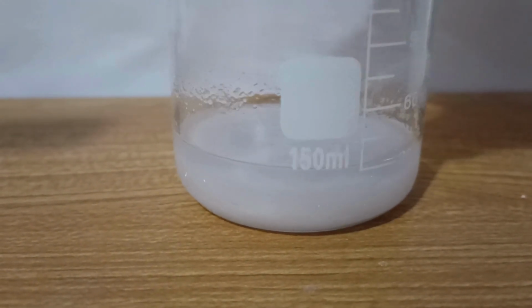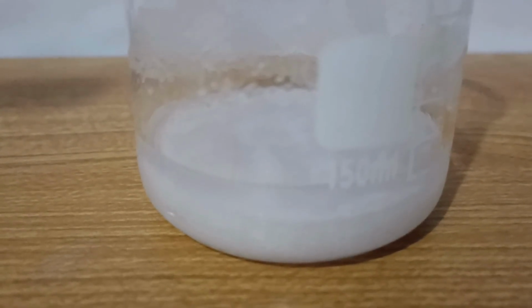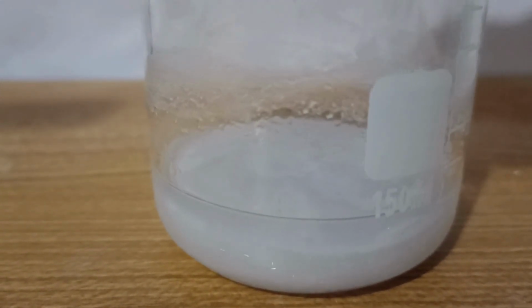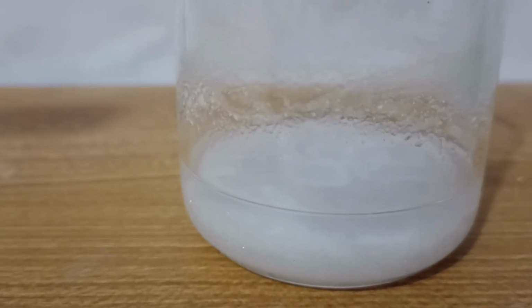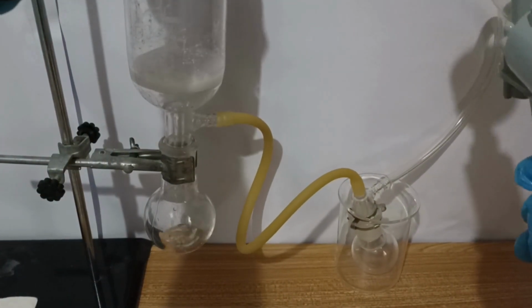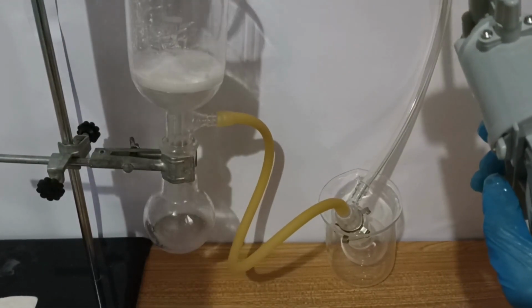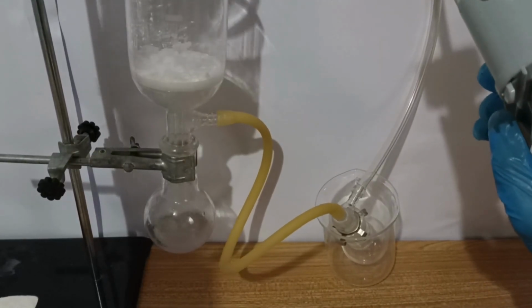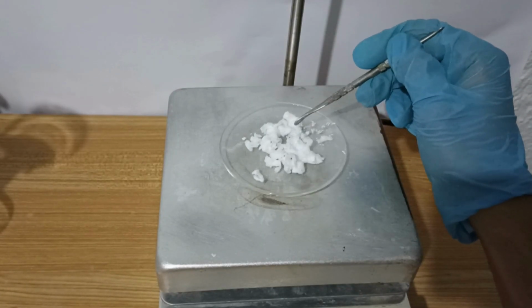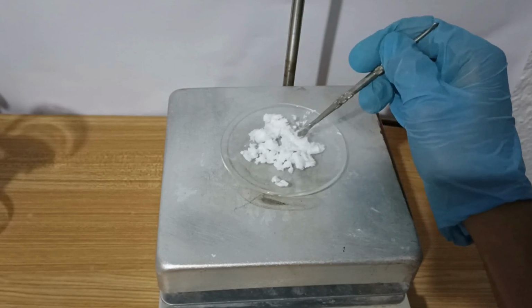The solution was allowed to cool, first to room temperature and then with an ice bath. This way we got white, tiny and beautiful crystals of phenytoin. We perform a final filtration and rinse the product with 10 more milliliters of very cold ethanol. I turned on the hot plate and, with a watch glass, I dried the phenytoin by moving it with a spatula for 5 minutes.